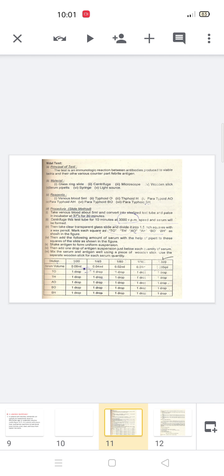And these are dome shaped, crenated, with a central black mark present in the culture colony of the salmonella, because the salmonella produce hydrogen sulfide gas by metabolic activities.